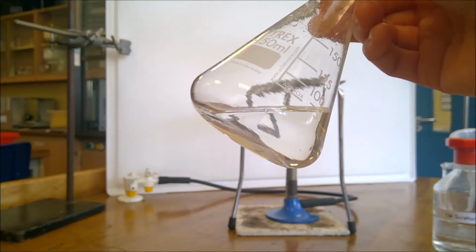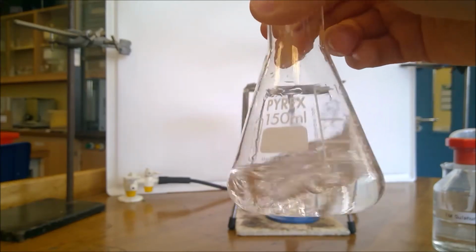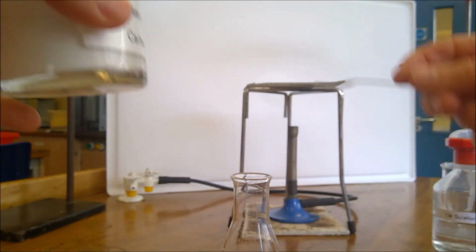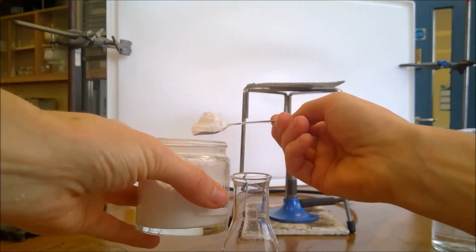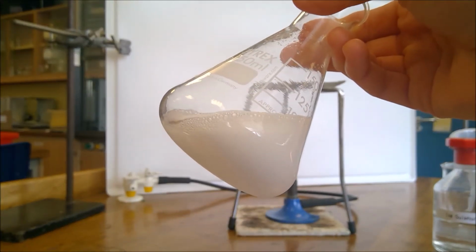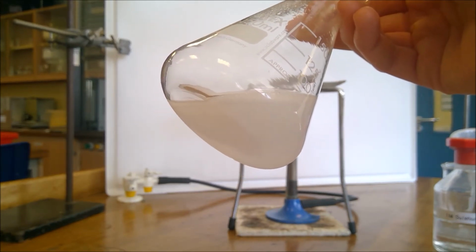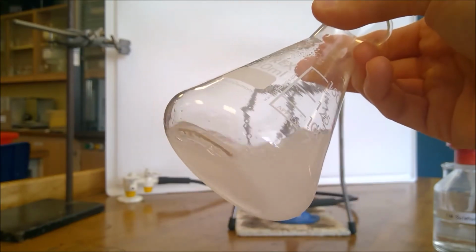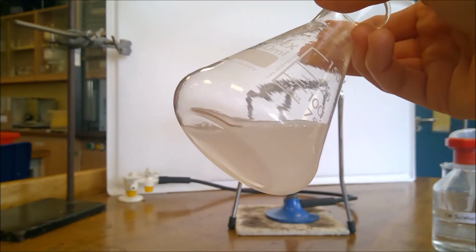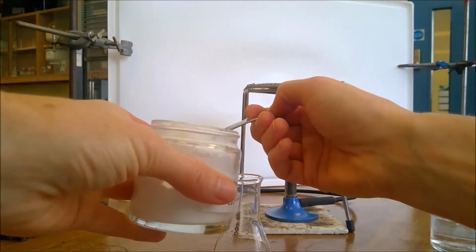So all of our magnesium carbonate reacted away there, but how are we going to know when all the acid has reacted away? So have a little think about that. So how about we keep adding the magnesium carbonate until no more will react. So we can hear and see our effervescence there. So we have a reaction going on. And we need to keep adding spatulas of our carbonate until there's no further reaction.